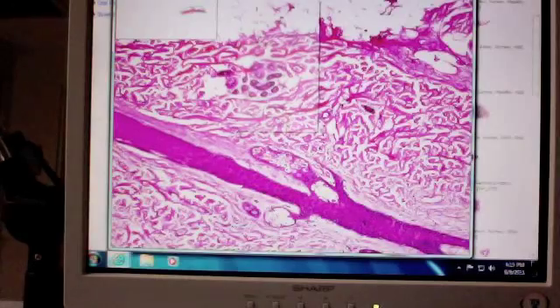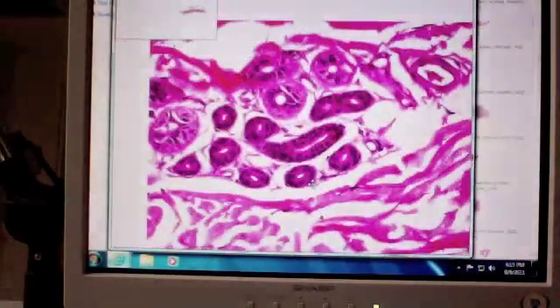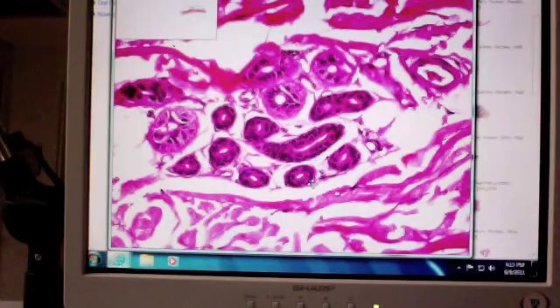We get something like this. All right? So if I put a circle around this and said, name this structure, where's my next person along here? Again, it's a simple coiled tubular gland, but because of the fixation method, and this is cut slightly thicker sections, it looks quite different. Okay? But again, you can see the paler staining regions that are going to be your secretory portions, and then beautifully bistratified cuboidal epithelium here. So these are all your little ductal regions.